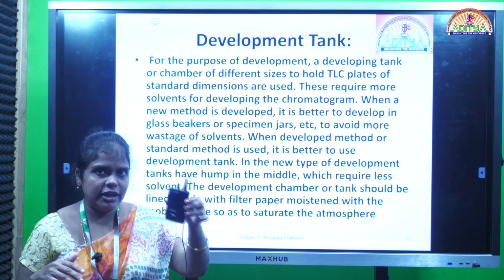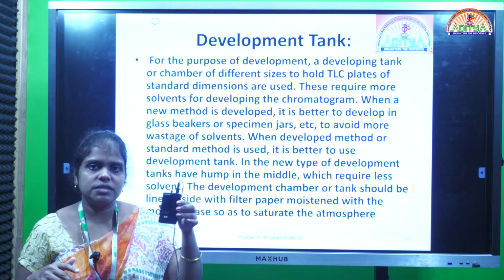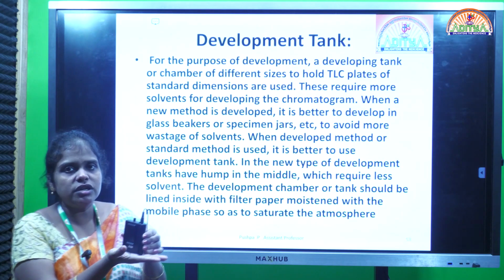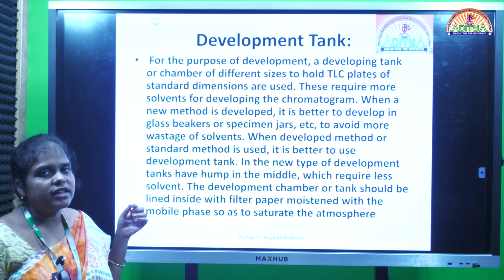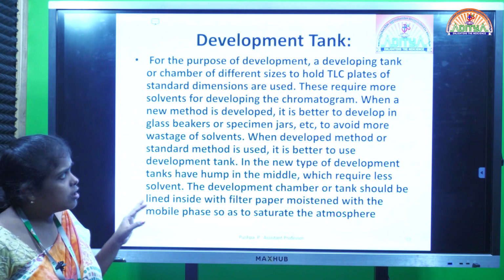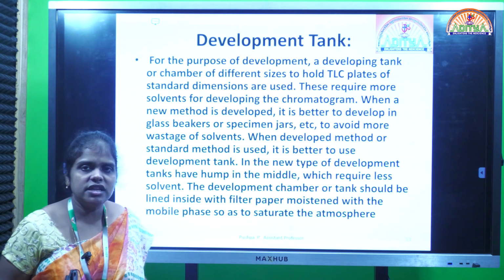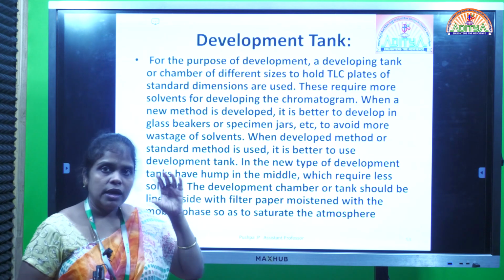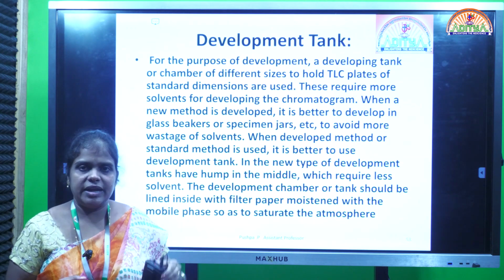you have to keep the plate, with the stationary phase and the sample spots, very carefully into that development tank. Understood? The development tank is the tank in which the development of the elution of the samples takes place. The dimensions of the tanks are very important in industries, but in colleges they use big beakers, take the mobile phase in them, and keep the TLC plate in that.